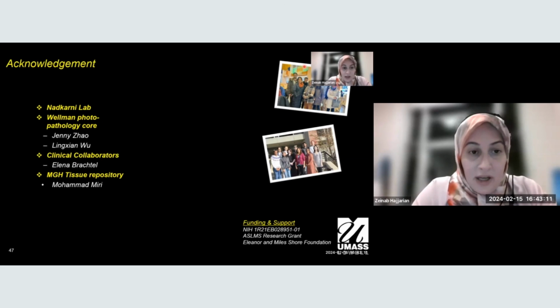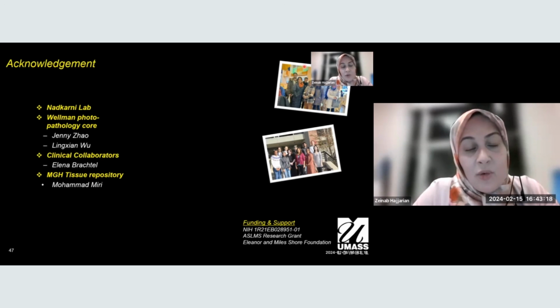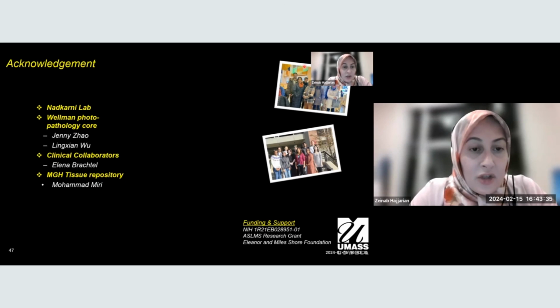Later on, for example, as you're aware, in Dr. Nadkarni's lab, this technology is being moved to blood coagulation studies. There, because of the higher absorption of 632 in the blood, the closest wavelength that still lets us escape the absorption bandwidth of hemoglobin is 690. So we switched to a 690 source.